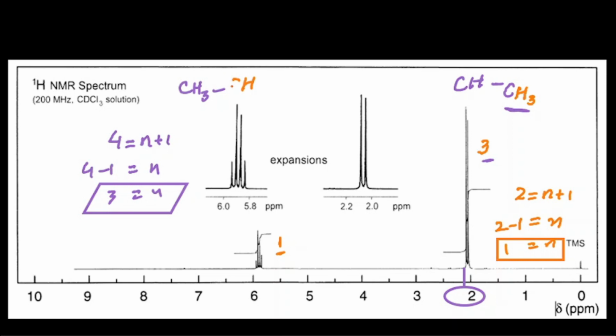This is the one hydrogen present here, and the chemical shift value is coming at 5.9 ppm. This value is not in the benzene ring range and also not further upfield. So it means that some functional group, some electron withdrawing group, is present here. Which electron withdrawing group is giving us the values in this range? In this range, we get the values only when some kind of halide groups are present here, or strong electron withdrawing groups are present.